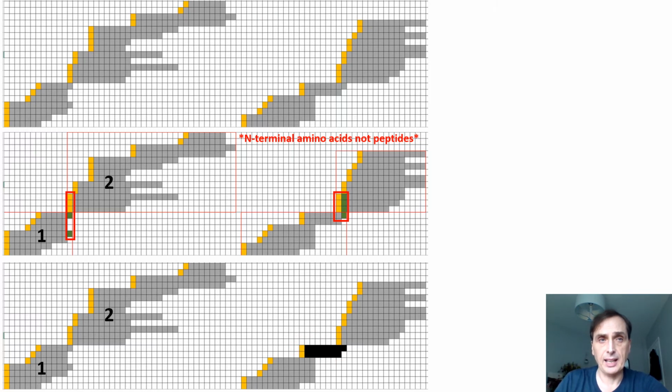And obviously if we delete these two peptides, then that will enable us to create two more subsections of data. And this is kind of the overall workflow that you need to go through in order to create subsections prior to submission for optimization.